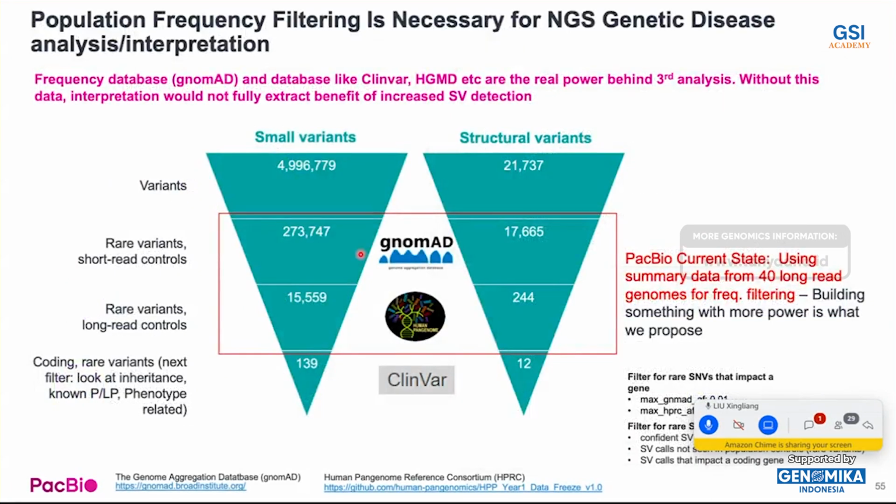Okay. At the end of the talk, I want to share some more information about the population database we are working on for HiFi long-read sequencing data sets. Researchers working on cancer genomics or rare inherited disease must know that population-based variant databases are quite important when we want to annotate our variants, right?